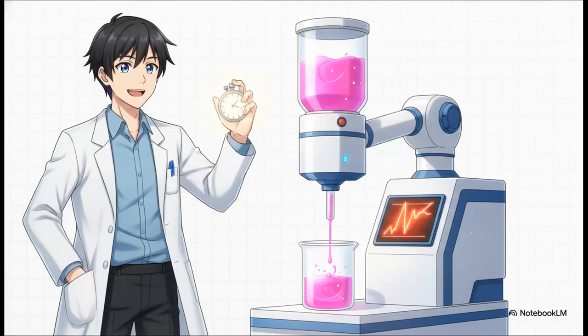But some modern labs are pushing the envelope even further. We're now seeing the rapid rise of the thermometric titration alternative. Instead of meticulously drying and weighing a precipitate, this method determines phosphate via a precipitation titration with magnesium. The equipment literally tracks minute temperature changes as the chemical reaction occurs to find the endpoint.